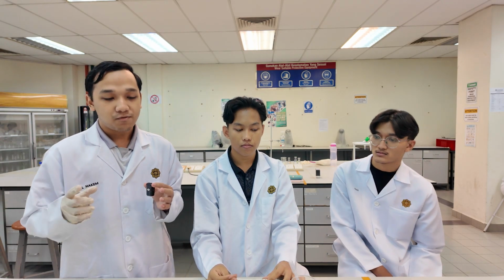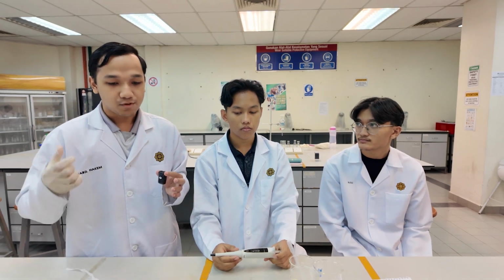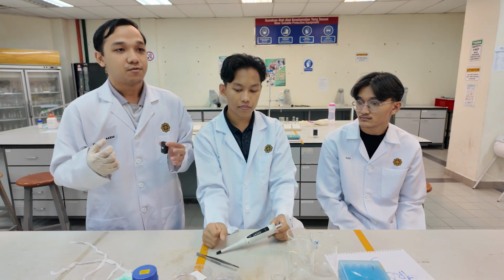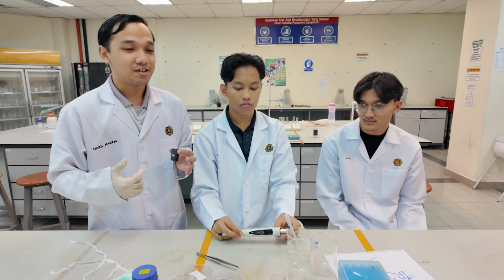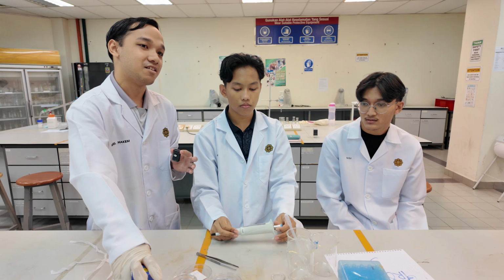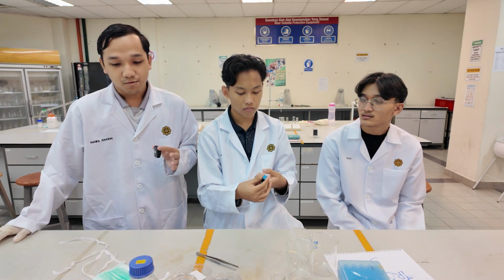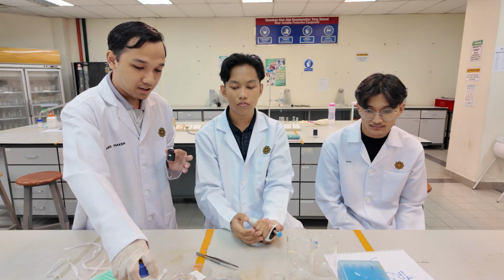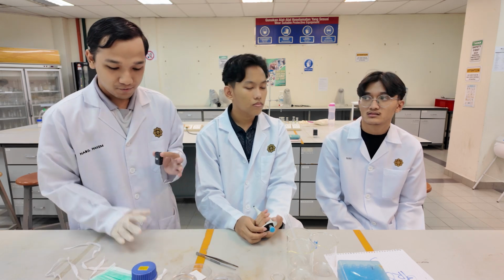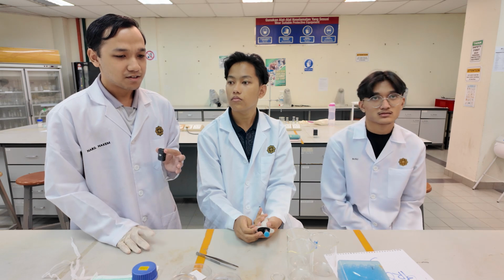For UV light, it depends on the wavelength. You have two wavelengths that we used in the previous experiment, short wave and long wave. Short wave is the most hazardous, also because we are already using some hazardous things. We should prevent using short wave constantly.